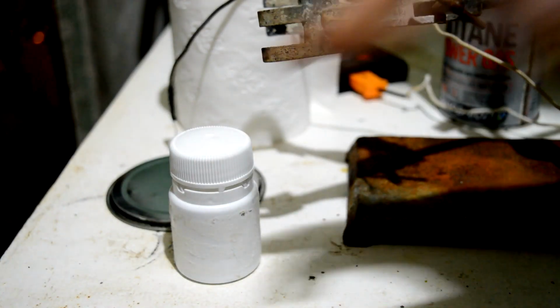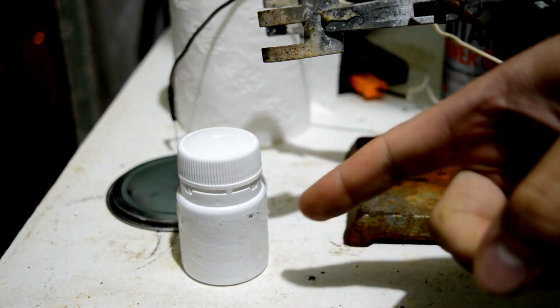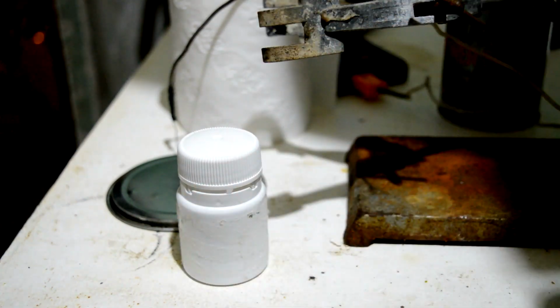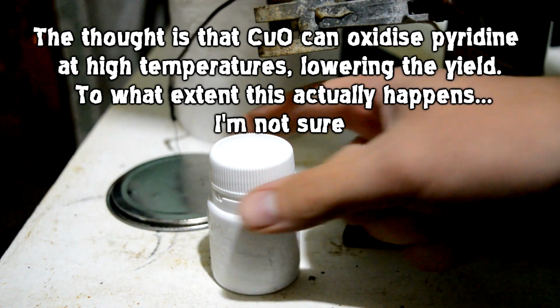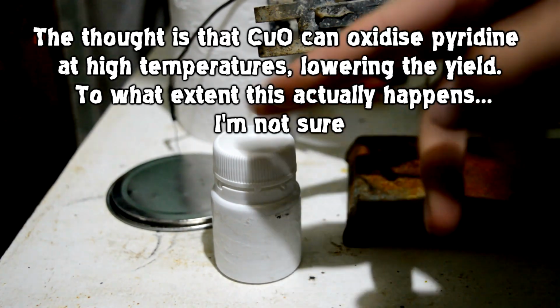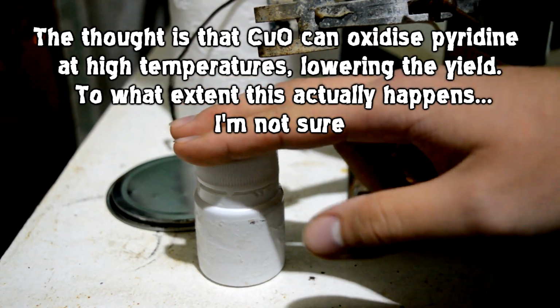Okay, I actually completely forgot about a step, and that's where we wash the solid with a bit of water and, like, you know, acetic acid or some sort of weak acid, which is going to remove the copper oxide and just leave us with the copper chromite. But we're going to compromise and just not do that step at all, because I've already bottled it and I don't actually have any acetic acid on hand. So we're going to see how it works without the washing step. I have a feeling it won't matter too much.